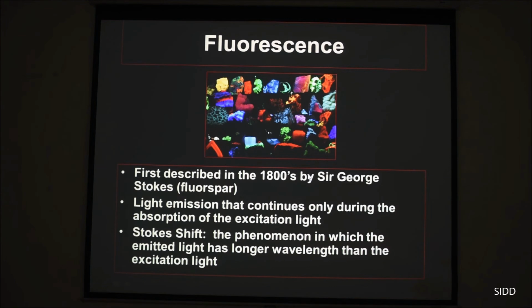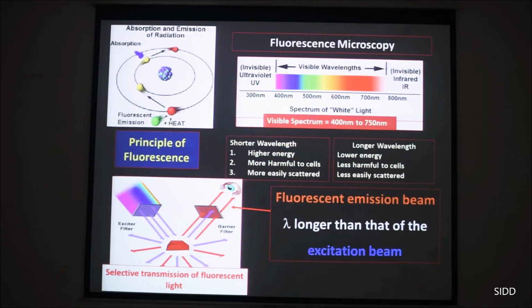Then we come to the next point, that is the fluorescence microscope, which has become very common because it allows us to look at specific molecules in a cell. And of course, before fluorescence became available, cytologists had developed what we call cytochemistry or histochemistry, whereby again one could localize specific classes of molecules by their specific staining properties or their reaction with specific stains. But fluorescence has become very important in microscopy today, and this is what led to the development of the confocal microscope, the phenomenon of fluorescence.